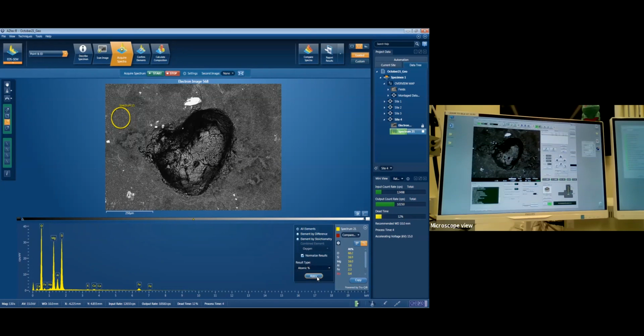We'll check the atomic weight, the atomic percent. Oh no, it's a 4. This is an olivine of some sort. Did you get aluminium bearing olivines? Yeah. I don't know, you know more about olivines than I do. Yeah. So what we're going to do in post-processing for Microscopy Live is Lorelei and Ash are going to work out the actual mineralogy for this, and we'll make a little pamphlet for everyone so you can see what we've done as a group.